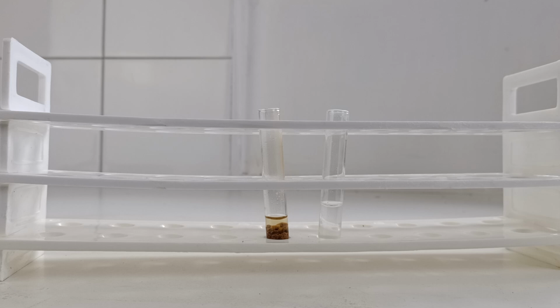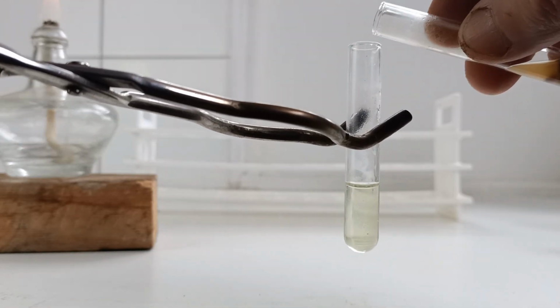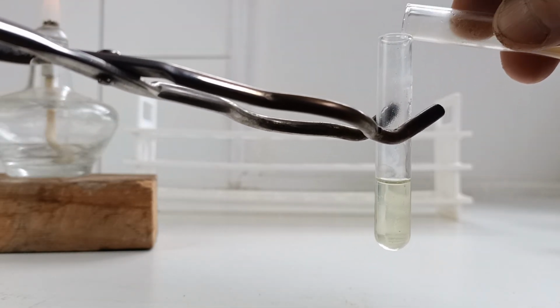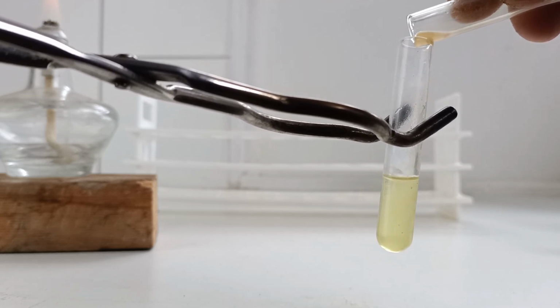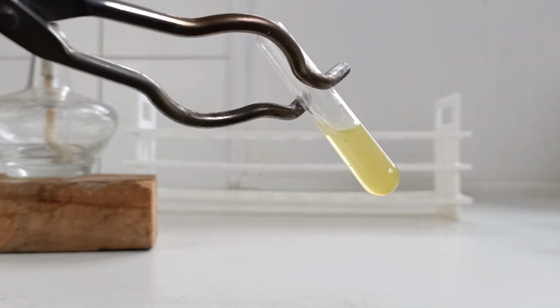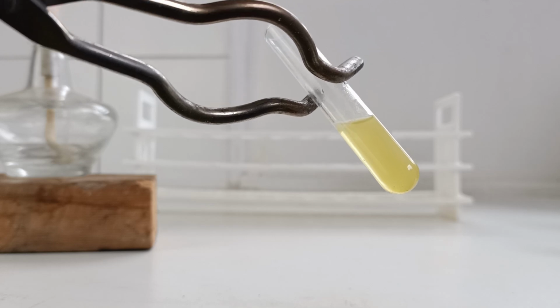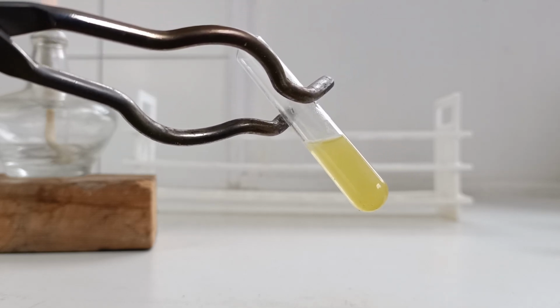Okay, so I've let that solution settle. We have a tube here, a clear tube next to it, which has the ammonium molybdate solution in it. Okay, so I've warmed this up, the ammonium molybdate solution. It's gone clear. Tip in a bit more of that and we should get a bit more of an obvious result. There you go. Didn't put enough in before. So that yellow there is a positive for phosphates. It's getting yellower and yellower there.